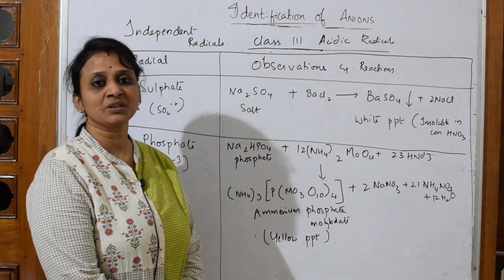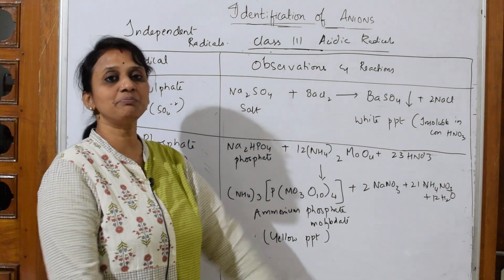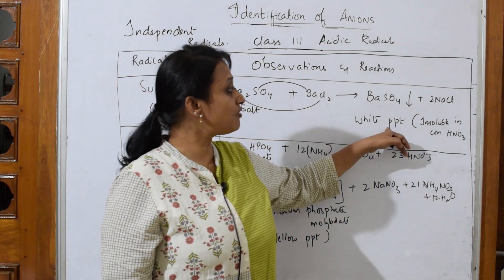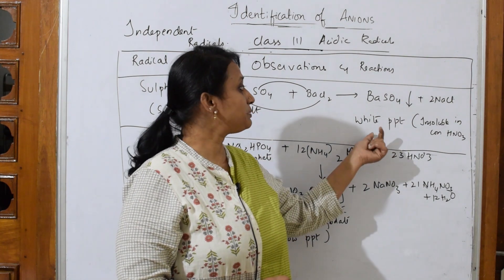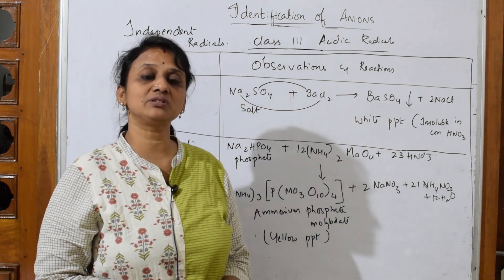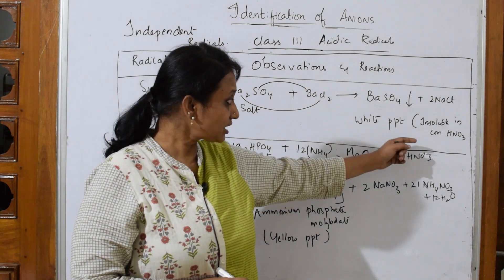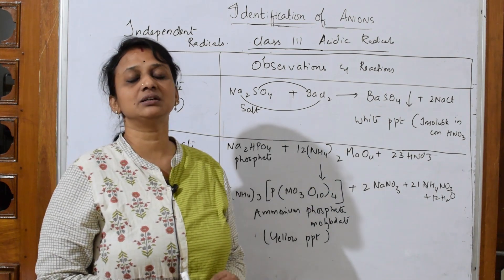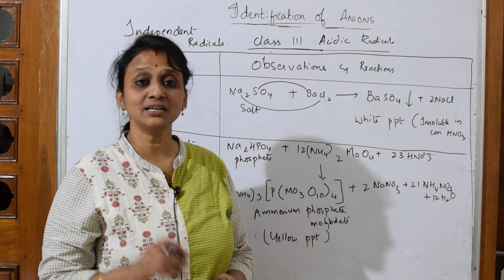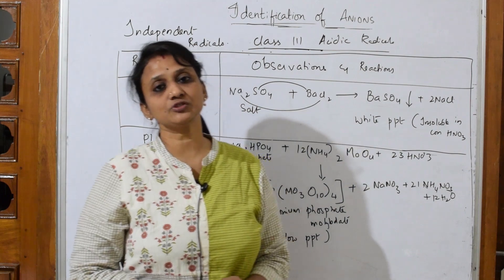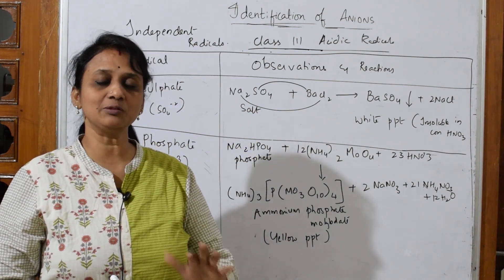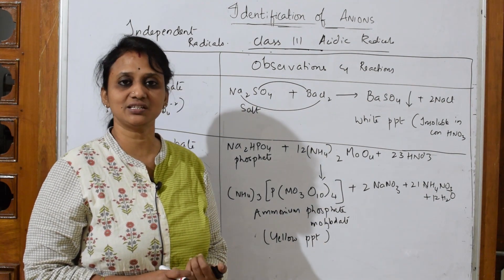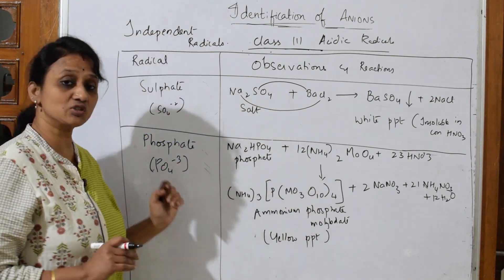Once you add barium chloride, immediately you get a white PPT. It's a double displacement reaction — barium sulfate and sodium chloride are produced. The formation of white PPT confirms the presence of sulfate. To further confirm, take the same white PPT and add it into concentrated nitric acid — it remains insoluble. That confirms the presence of the sulfate anion. Salt + barium chloride gives barium sulfate white PPT, which is insoluble in concentrated nitric acid.